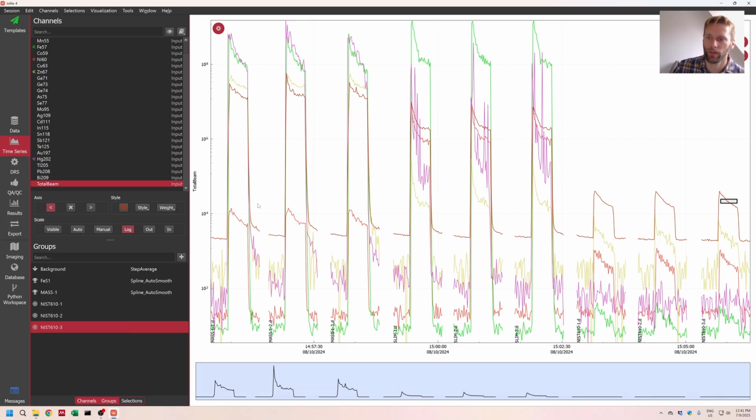And you'll have to label it with the name of that analysis. It's a pain, but this isn't the quickest or the easiest way to do it. This is the most intuitive way to reduce your data. There are easier ways that maybe I can explain a little bit at the end of the video, but for now I want to stick to intuitive, simple ways where we can get good data without digging into the program too much, which you should definitely do later on as you get more advanced with the program. Okay, this is supposed to be super basics.